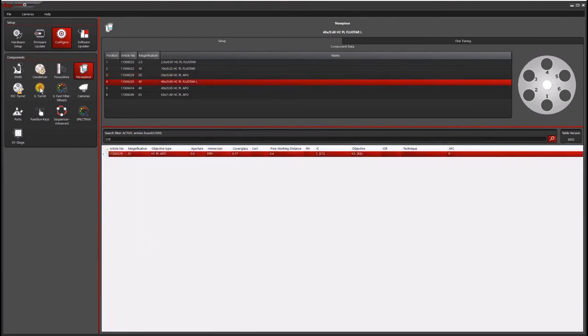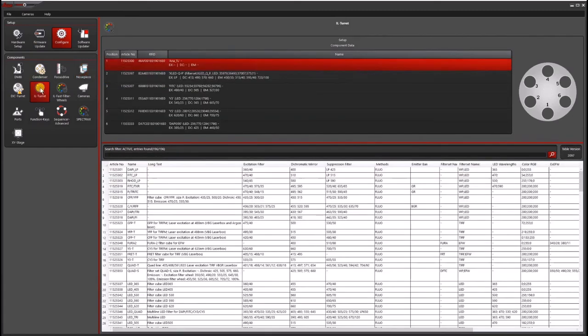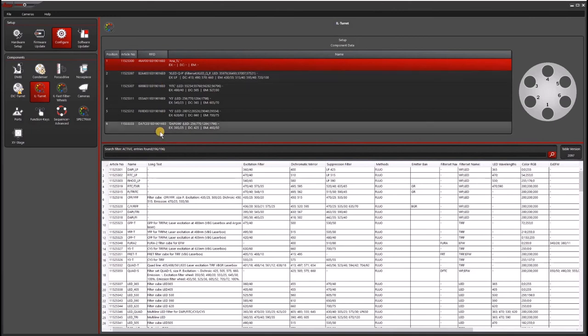And then the same thing for the filter wheel, which is called the IL turret. And you would go ahead and enter the correct filter for the correct position.